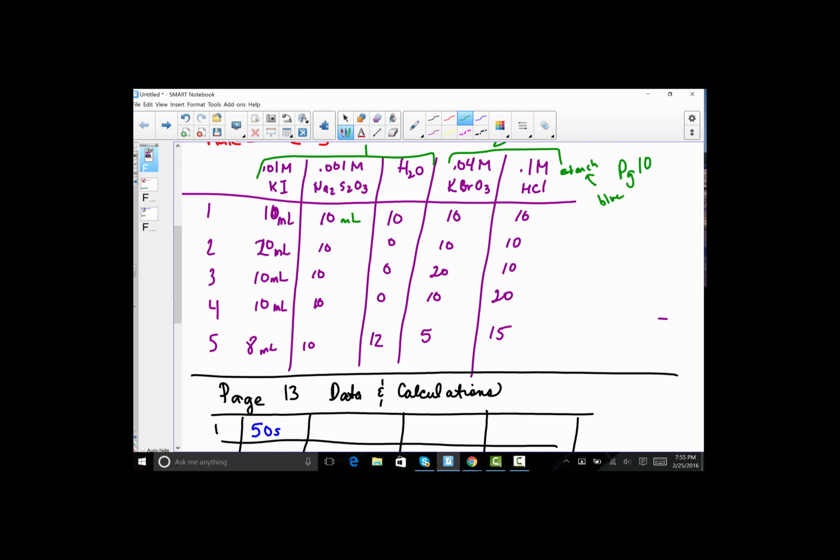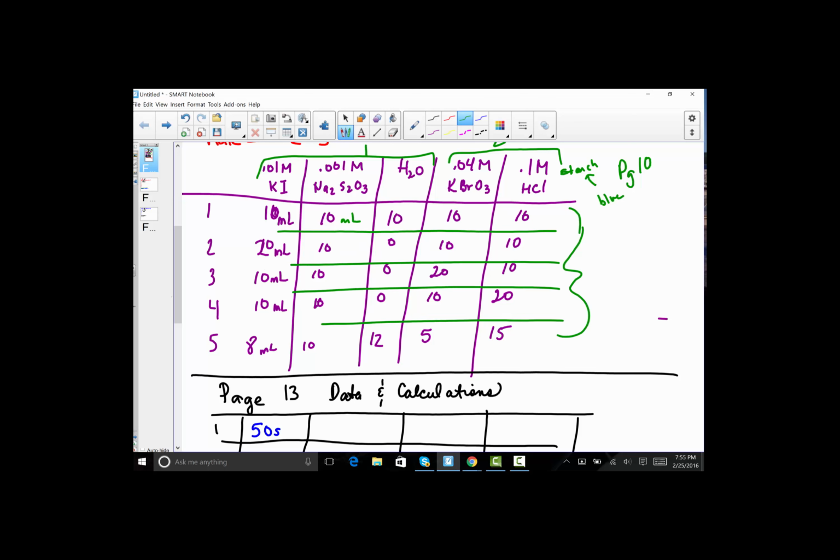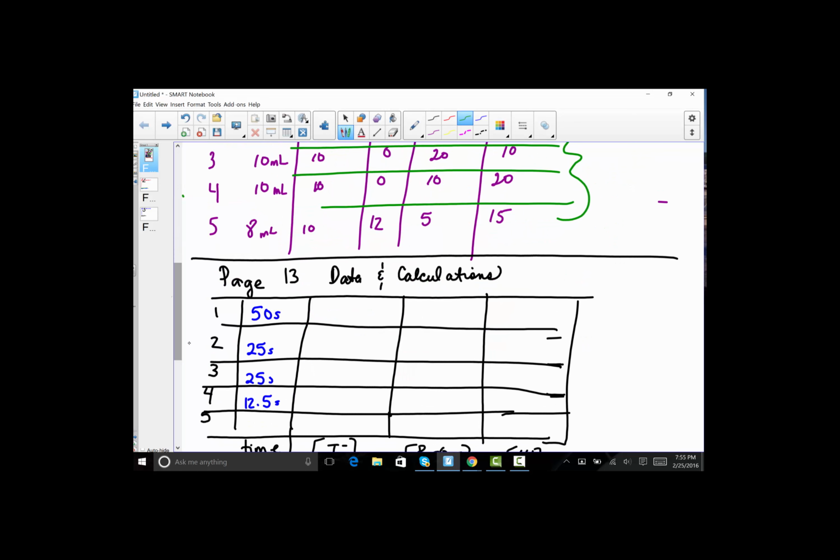Notice that just as in last week, we have this constant volume. If I look at how many milliliters of each we have each and every time we run all 5 of these trials, if I add all volumes, you're going to see a consistent, constant volume there of 50 mLs. So no matter how I vary each of these ingredients, I always make sure I end with a constant of 50 milliliters. So let's take a peek at some information.